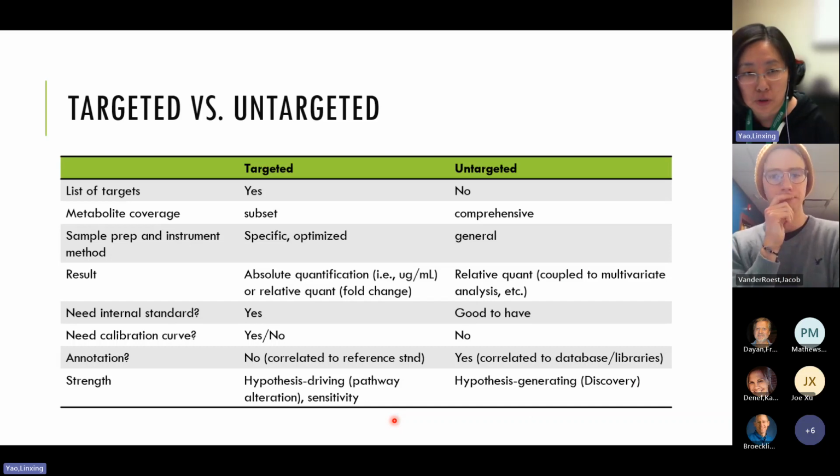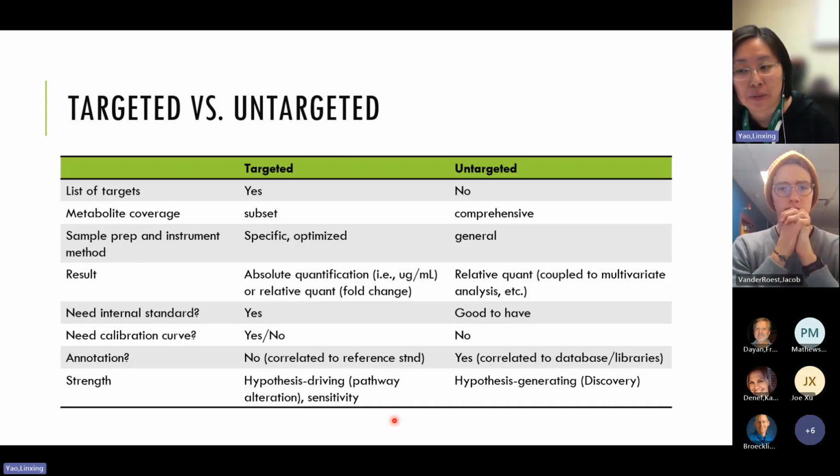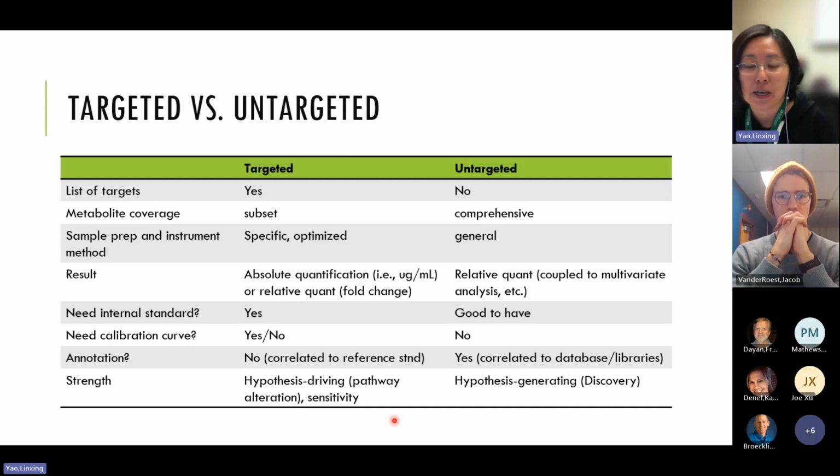So the research strategies for metabolomics have been divided into two approaches, targeted and untargeted analysis. Untargeted metabolomics is the comprehensive analysis of all the measurable analytes in a sample, including chemical unknowns. In targeted analysis, there are only a limited number of metabolites analyzed. So the focus of sample prep should be on the needed metabolites while largely removing interferences. So the extraction method is usually customized.